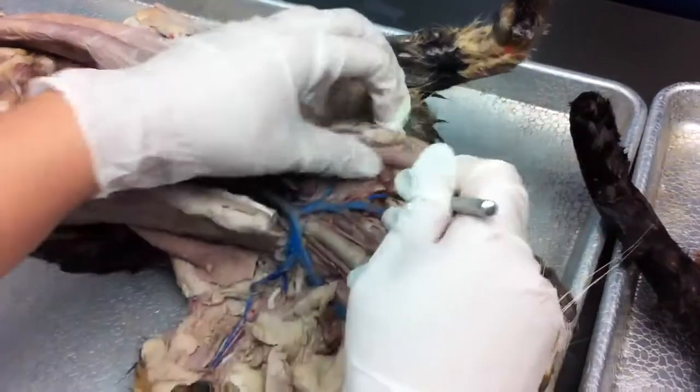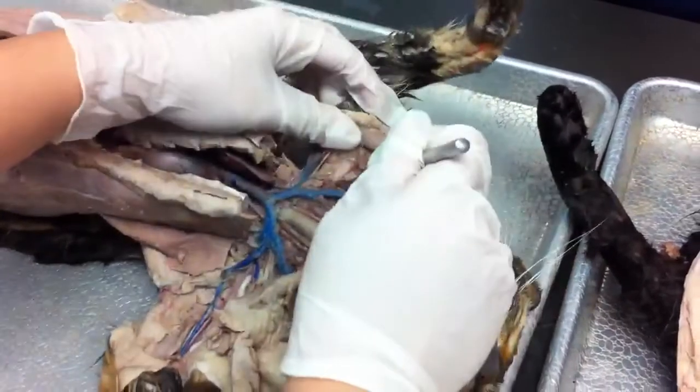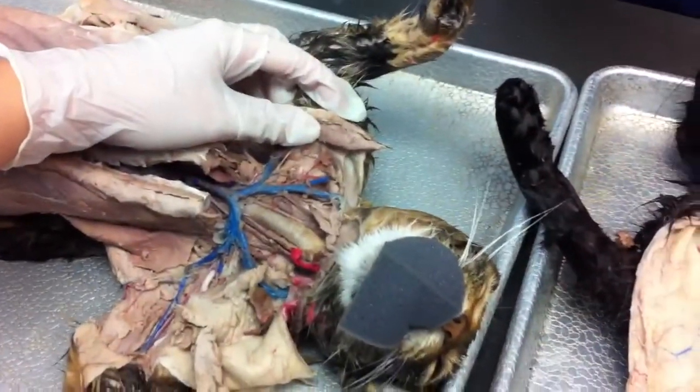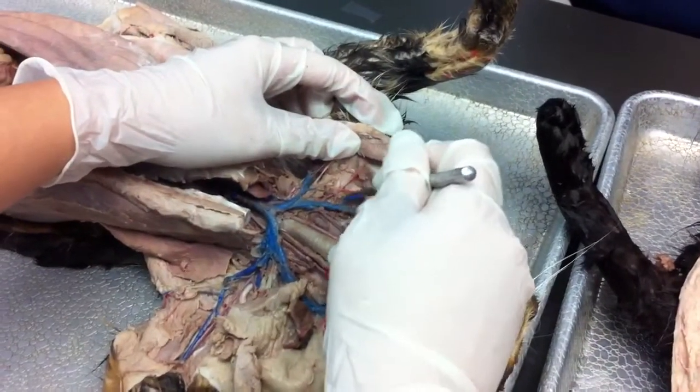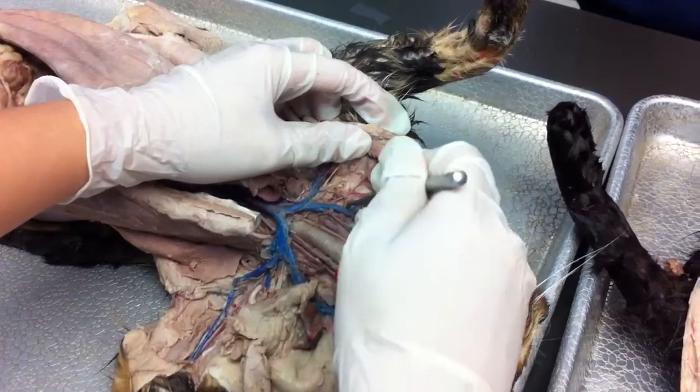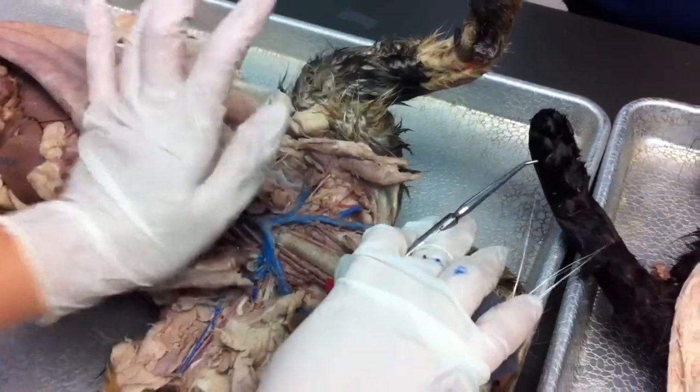Okay. And then coming off, you see this other Y. This Y that comes back, it actually wraps all the way around his shoulder. That is the right transverse scapular vein. So think of like scapular, like shoulder blade. This transverse scapular wraps around to his shoulder blade. That's it for the veins. The veins are pretty simple.